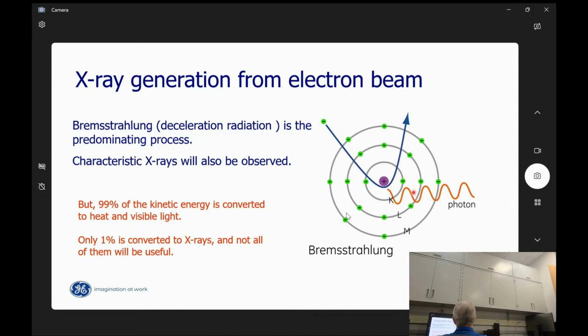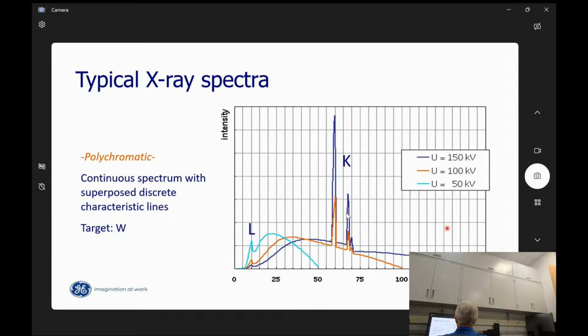The other X-rays that we're going to get are from electrons being kicked out of core shells and higher valence electrons falling in and emitting characteristic X-rays. So this is going to happen, and it's a useful parameter as well. For example, I'd really rather not get below about 60 kV on a tungsten source, because I'm going to drop about half of my counts doing that.